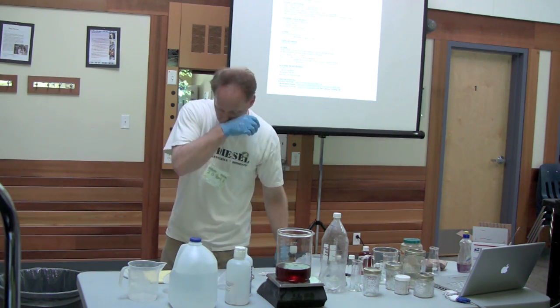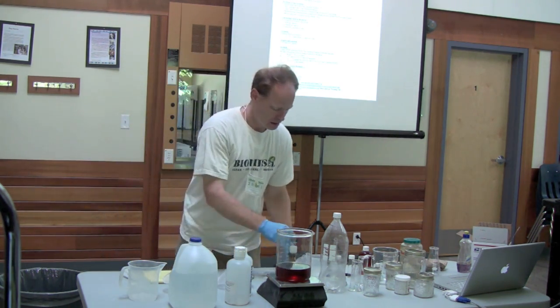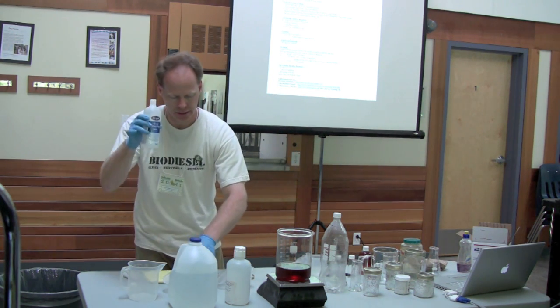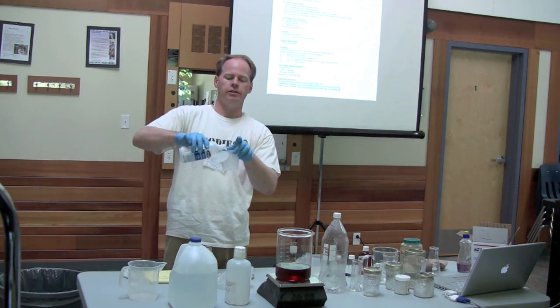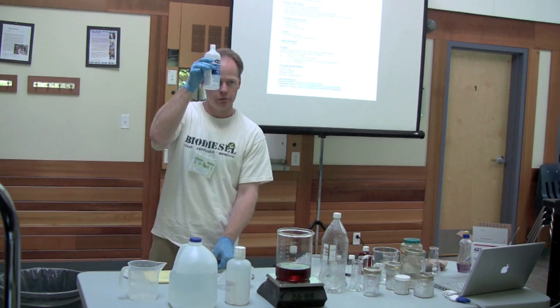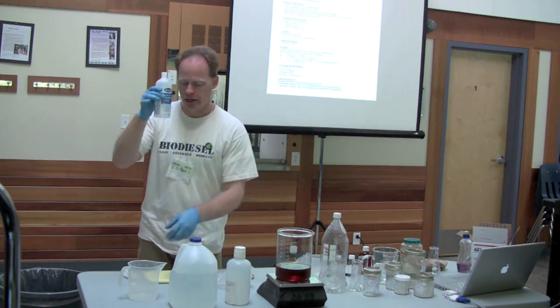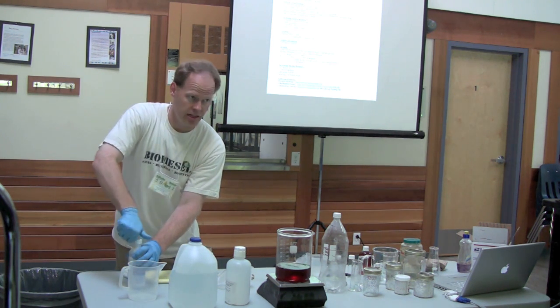Okay, let's talk about our basic recipe to do a titration. You take 10 milliliters of isopropyl alcohol. I'm going to take some of this, just pour it into another container. A tip when you titrate is I never, ever, ever, if I can afford it, draw from the source container. I'm playing with syringes that may have touched some different things, and I don't want to contaminate them if my intention is to later use the stuff again.